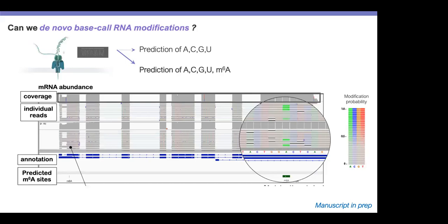Okay, and this is just to illustrate a zoom example, right? Some random examples. This is just the gene with the different coverage, with the different isoforms. You can see nice splicing with some differences in the splicing variant, right? And you can say, okay, look at these reads here that have this modification. These ones are in general in the isoform that is mainly spliced out, whereas the other one is mainly in the one that is non-spliced. So you can now really start doing what we were discussing, which is isoform-specific M6A modification patterns.